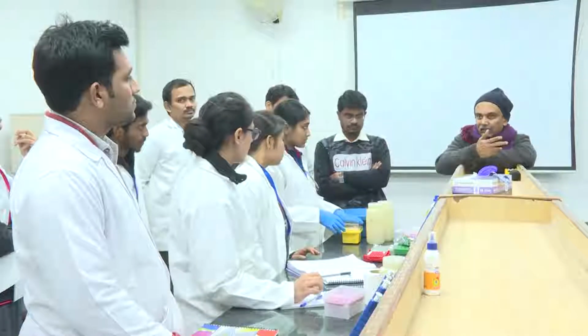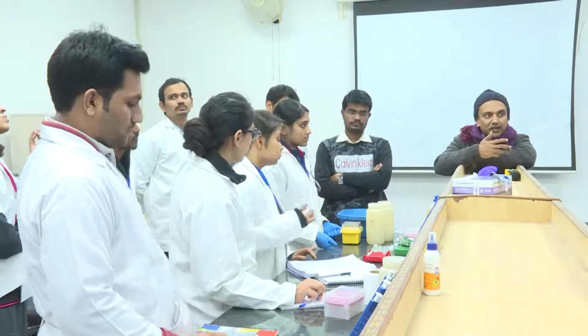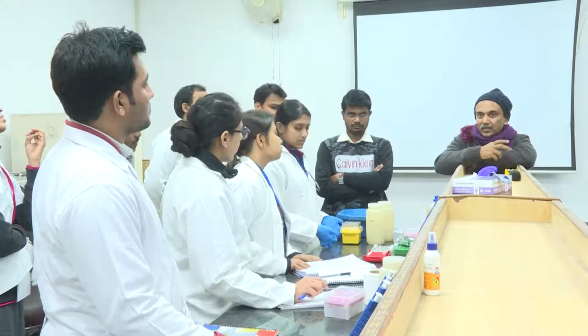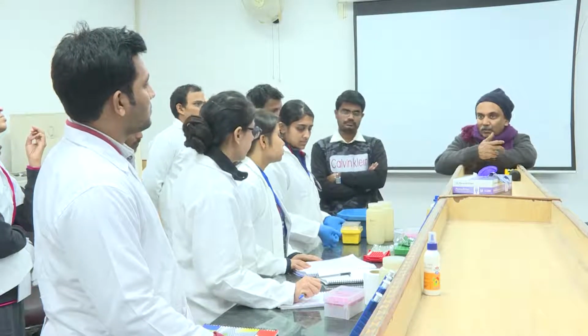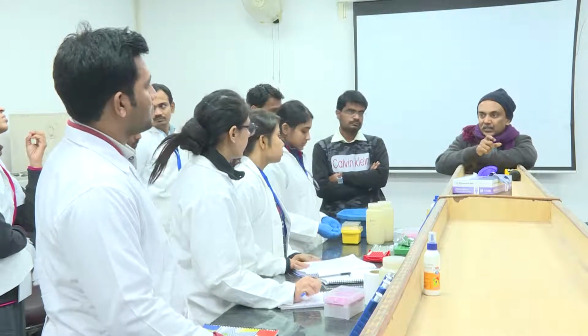If you have markers which are very specific, I am talking about bacterial markers, you should have. 16S may not be an interesting marker for us because several organisms have multiple copies of the 16S gene. So you are not able to relate the gene with the number of microorganisms present in the sample.